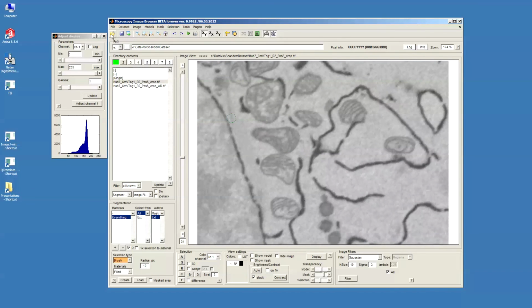Let's take a look at the toolbar. So the toolbar has a number of buttons that allow fast access to certain actions. For example, the first button is open file, but it's more like used to import a file from the Matlab workspace. The second one is the save model. We don't have any model yet, so we can't really do that. Then another button is for developmental purposes.